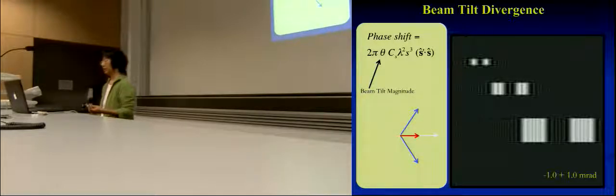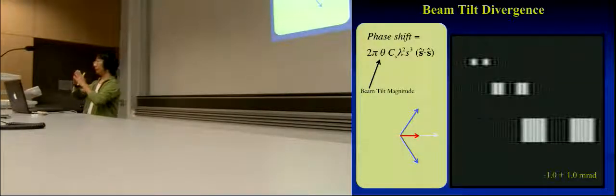So in a way, when you think about the convergence and divergence, when you look at this effect on our average structure, it's actually like a B factor type of thing. It's damping down the contribution at that frequency.